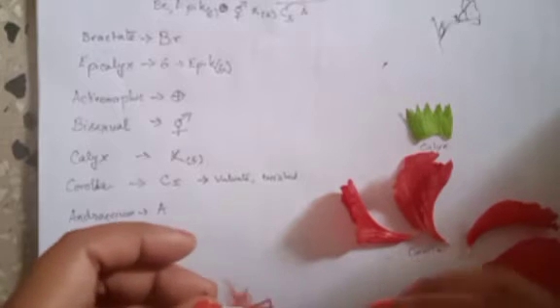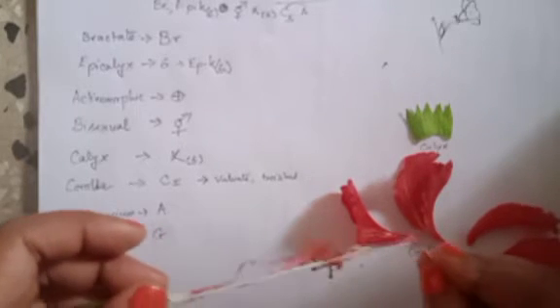So here. Okay. So see, I have taken off my style. This is my androecium that I have taken out here.